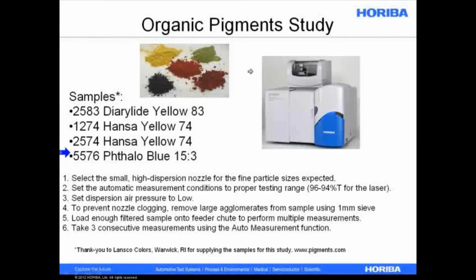We measured them as a dry powder in the LA950, the instrument you see here, where the powder just feeds through the dry powder feeder through the system. We look at the light scattering. We calculate particle size. We're not going to cover that today. There are plenty of recorded webinars on the website talking about the technology. Today we're just going to talk about using this technique and what the data looks like. But I note down here how we made these measurements.